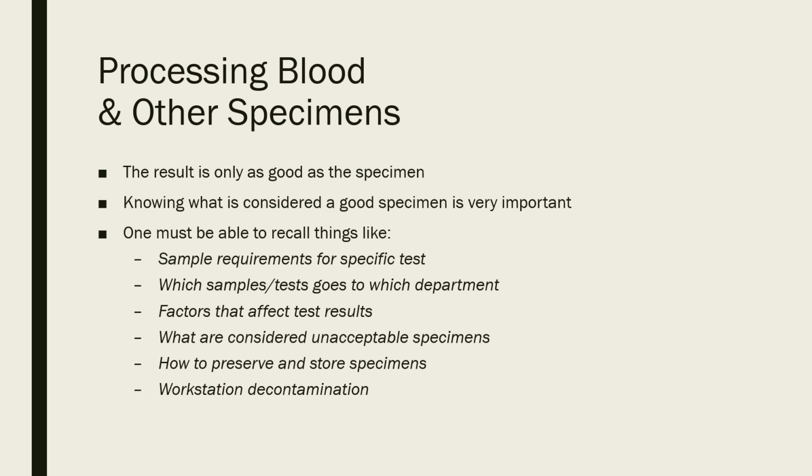What should you consider when you're looking for a specimen to be unacceptable? What should you do to preserve and store those specimens? What should you do to make sure that you're not having any kind of contamination from your environment or workstation?